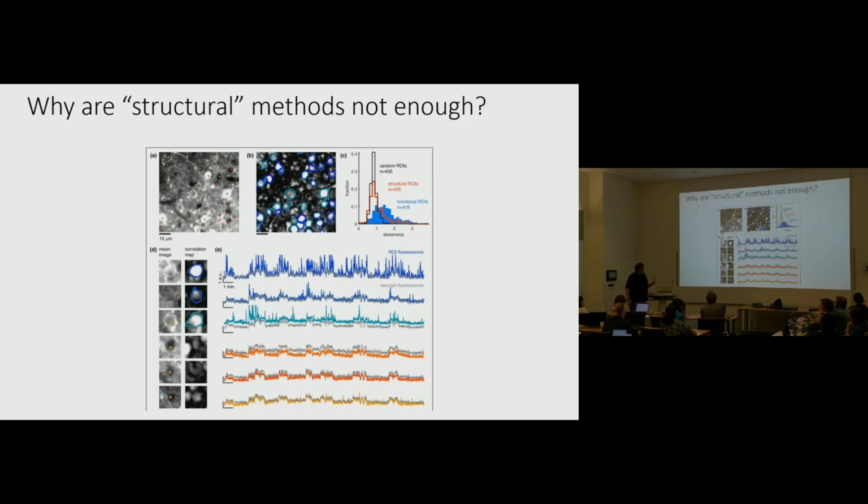And so you might say, okay, but this is circular because you went in looking for things that had functional activity. So of course you found them. But then, really, isn't that what we're trying to find? Are we trying to find signals that are functionally related to action potentials to be able to analyze those in relation to something else, right?